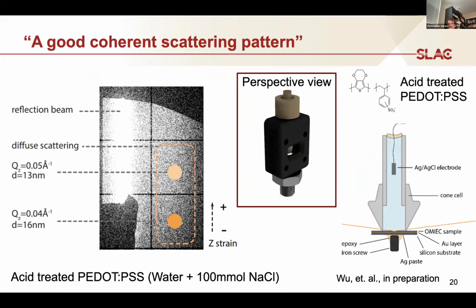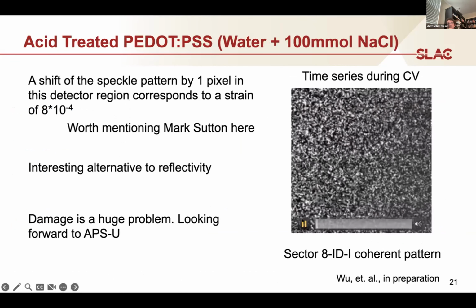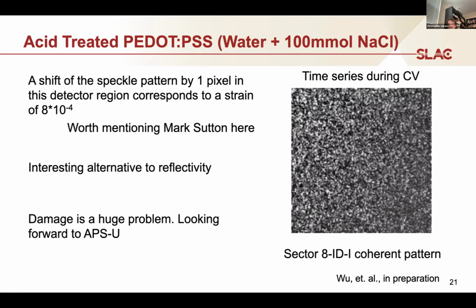This is what coherent scattering actually looks like, which many of us are familiar with. You're getting 0, 1, 2, or 3 counts typically in the region that you're looking at. Shown here is a perspective view of the cell, and we're going to start off by looking at PEDOT:PSS in water with 100 millimolar of sodium chloride. I'll put the time series up, and I'm not expecting anybody to see anything in here.